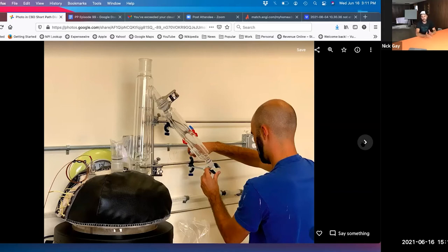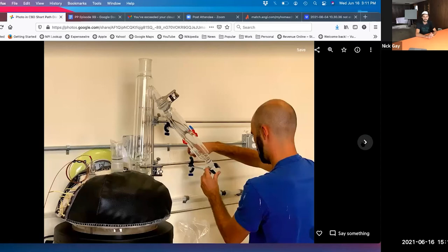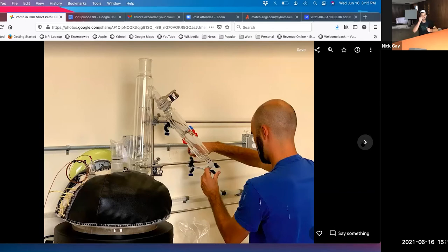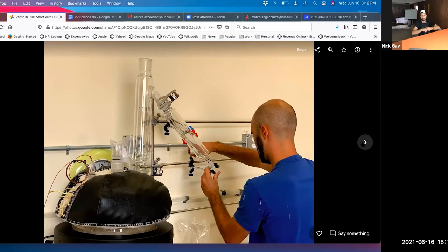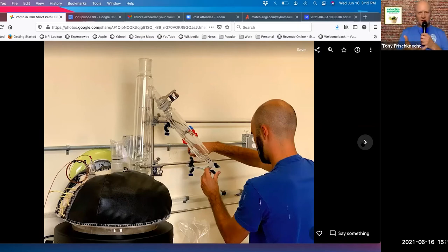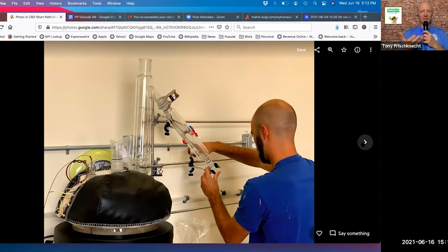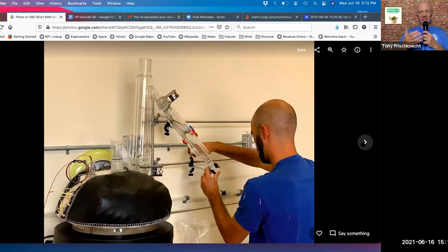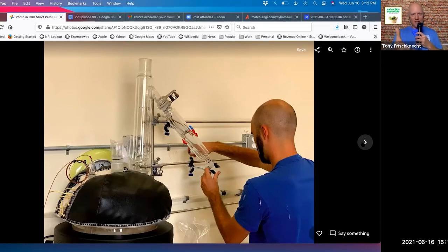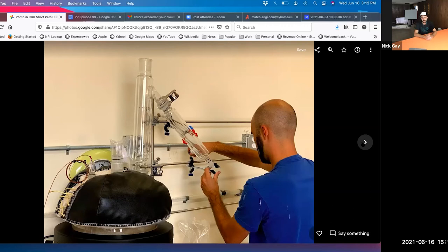One of the major things you want to keep in mind with a setup of glassware like this is support. The hardest thing about setting up one of these pieces is setting up all the clamps to hold stuff and support your glassware so there's not too much strain on each joint. This looks like a high-end distilling setup, like you would distill alcohol.